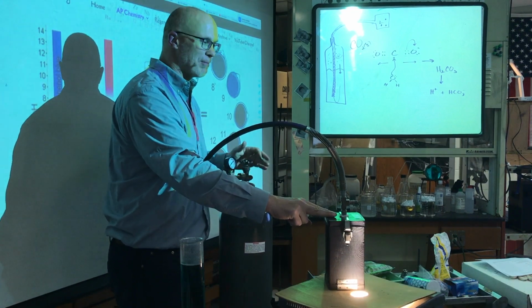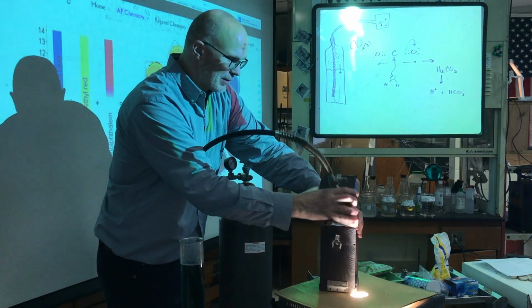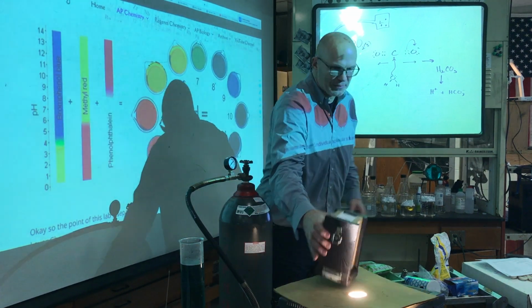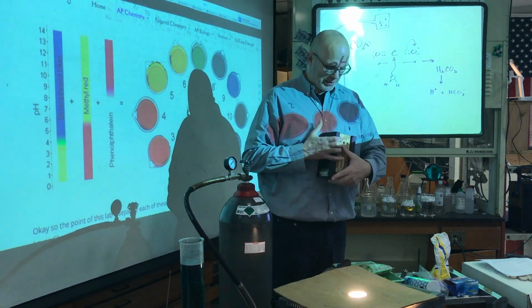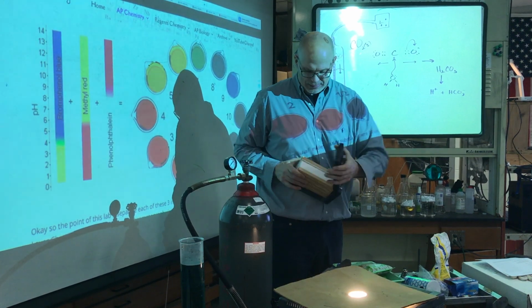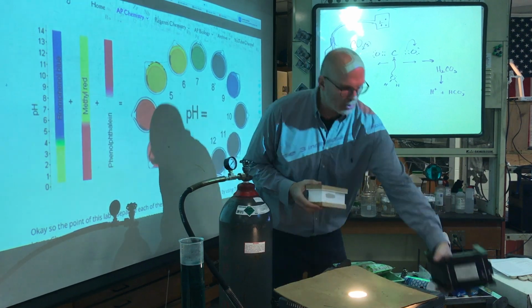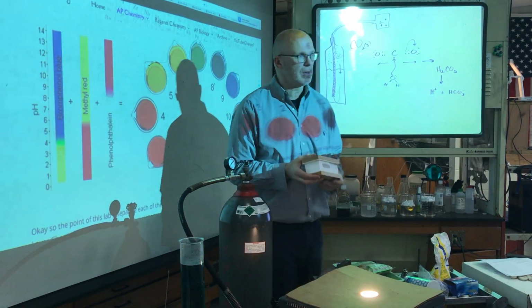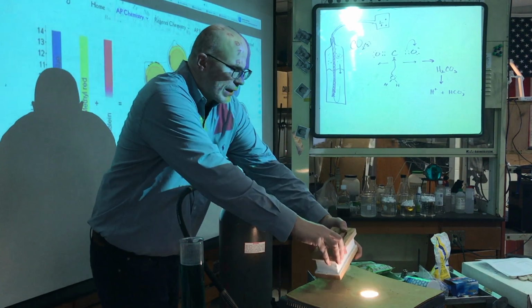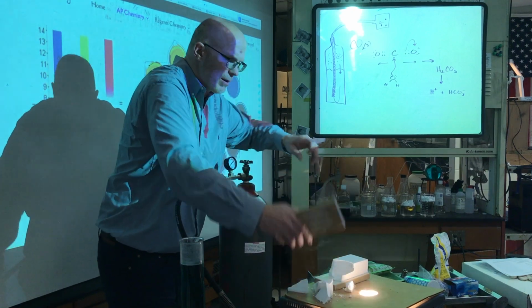we know that this guy, and there's my box, and it's not empty anymore. I got myself a white solid. It's not completely a block, but what we have here is a good amount of dry ice. We call it dry ice because CO2 likes to sublime. It's also a very brittle solid. Molecular compounds are brittle, right? So they break up into little pieces very easily.